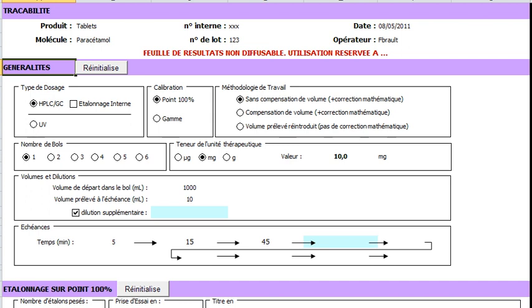Here we enter the value of the dosage unit. It can be chosen in micrograms, milligrams, or grams. Here we enter the initial volume in the vessel. Here we enter the volume of each aliquot.